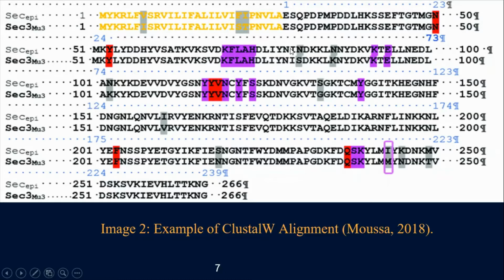And these various colors that can be seen in the picture represent different aspects of this amino acid sequence. So basically, this is what would be outputted from the Clustal W program when trying to figure out the multiple sequence alignment for organisms. I will now hand you over to my colleague who will continue with this presentation.